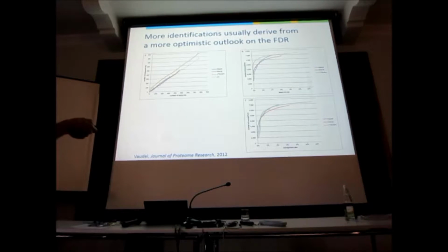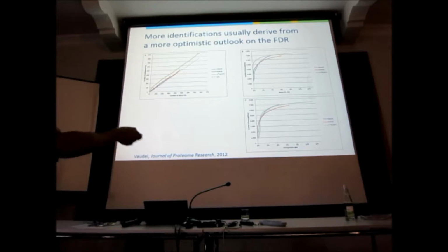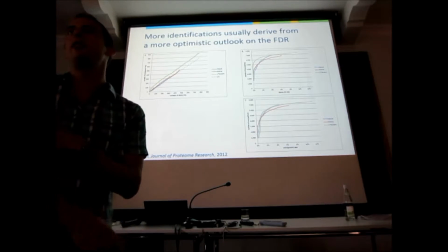But you say that Mascot is really built for 5% FDR. That was the original default threshold. Look at where it shines. Mascot shines at 5% FDR. It's optimized for that. It has always been. Using Mascot at 1% FDR doesn't kill the algorithm, but it's better at 5%. It's an interesting observation, and it's something that kind of makes sense.